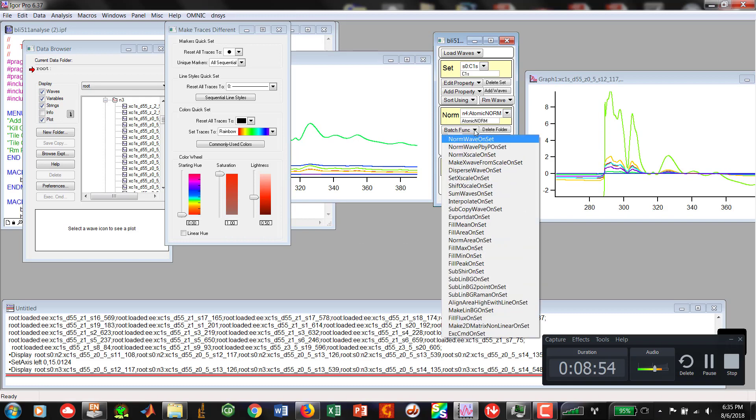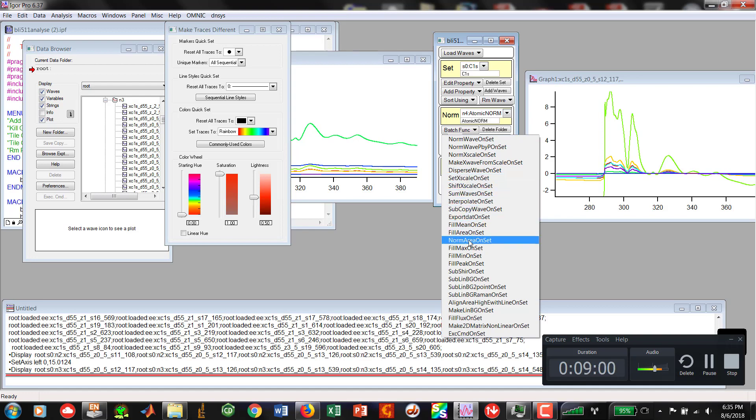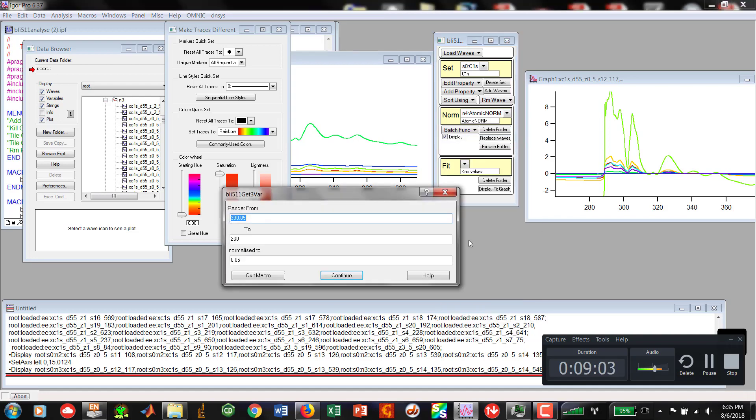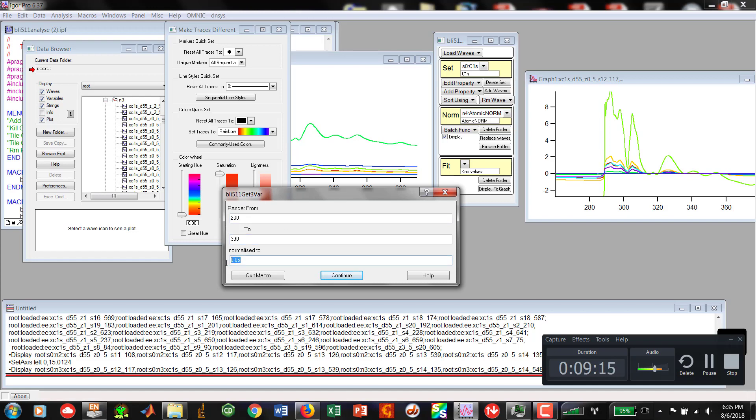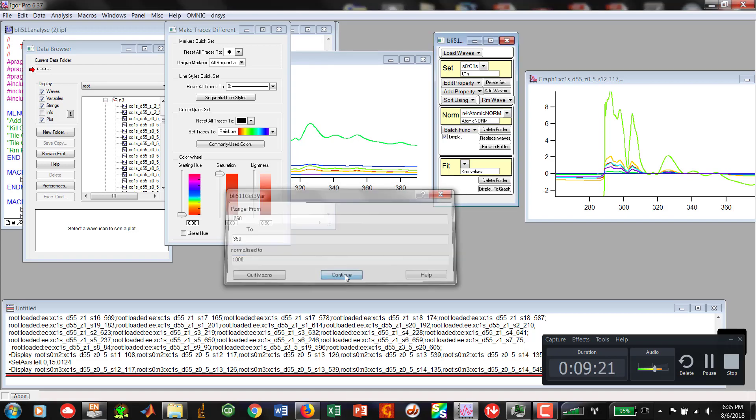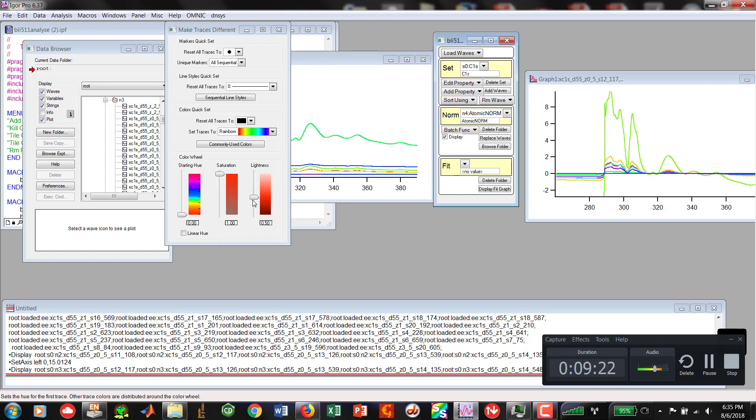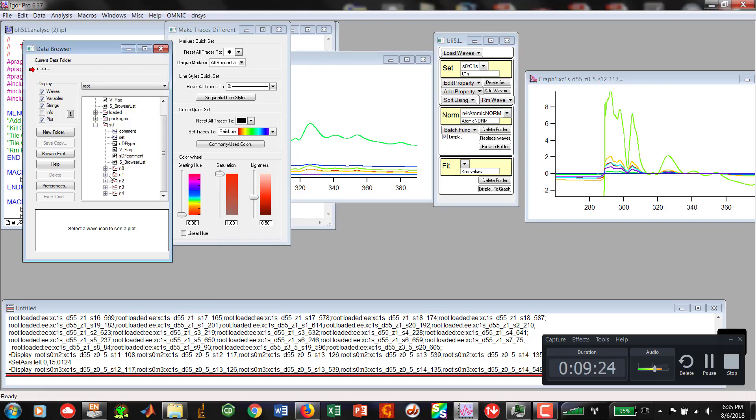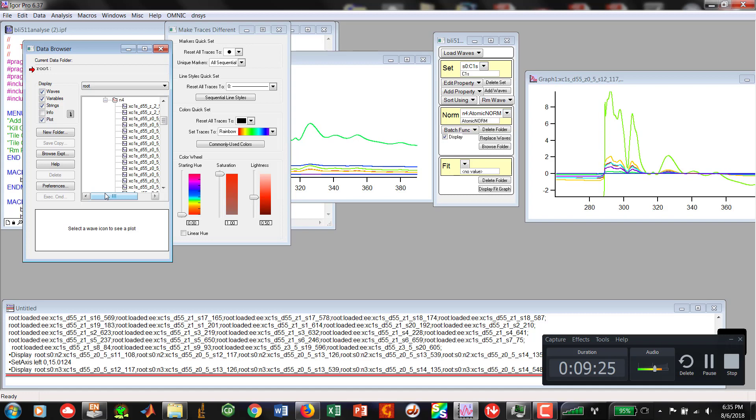I can go ahead and go to our next batch function, which is Norm Area Onset. In the range again, I did it incorrectly last time. It should be the small number to the high number. The normalization, I've seen anything from 1 to 1,000. Right now, I'm just going to go ahead and pick 1,000.